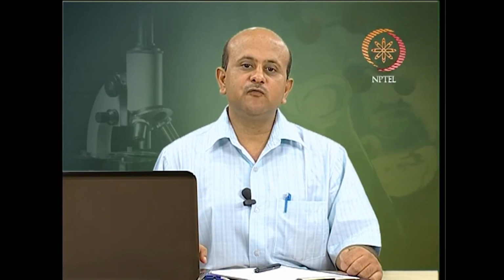Then there is the near UV spectral region, which is 250 to 350 nanometers, and here the chromophores, as we were discussing, are aromatic amino acids and disulfide bonds. We have discussed phenylalanine, tyrosine and tryptophan. They absorb at different wavelengths, and disulfide bonds can also contribute. So, the patterns obtained for, say, phenylalanine, tyrosine or tryptophan can give important information about the changes in conformation in tertiary structure, because of certain shifts in their absorbing patterns.